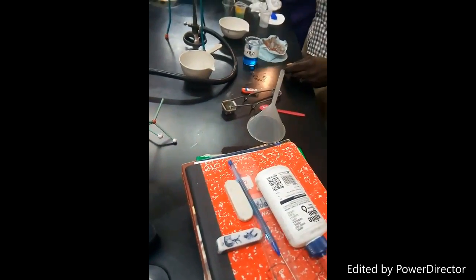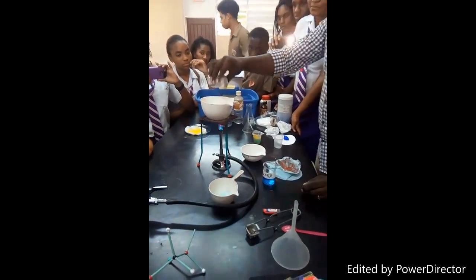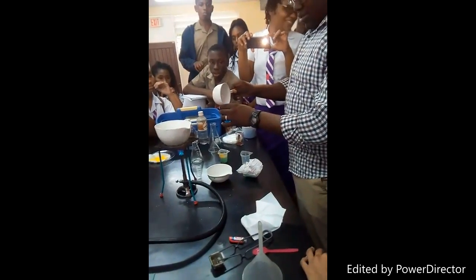Of course, we can still use it. Now we're going to see if we can get the potassium nitrate. Okay. It's just boiling. That's all. Just boiling.